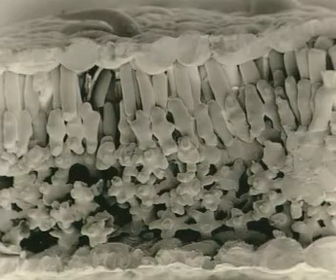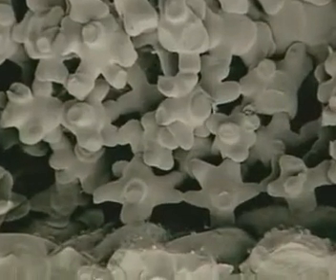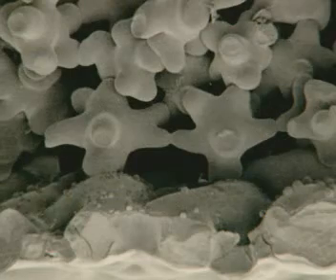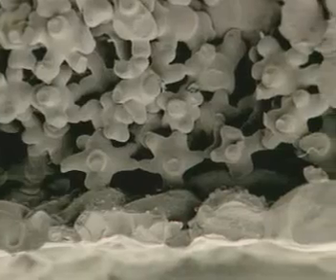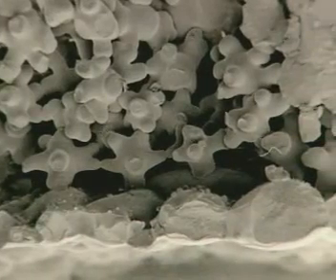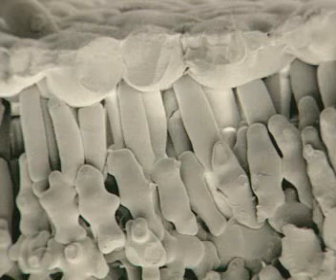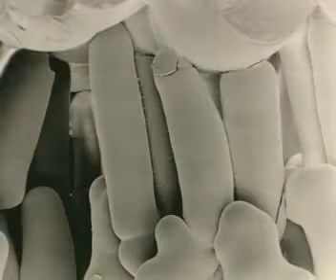In the lower half there's a group of strange looking cells which make up the spongy mesophyll. There are large air spaces in between. This makes it easier for the plant to take in carbon dioxide for photosynthesis. Near the top surface is a row of elongated palisade cells — it's here that photosynthesis takes place.